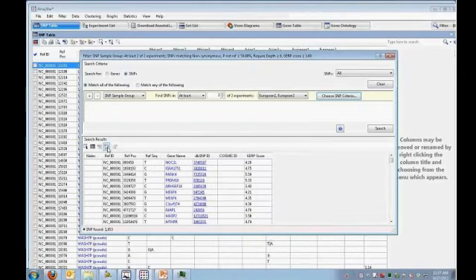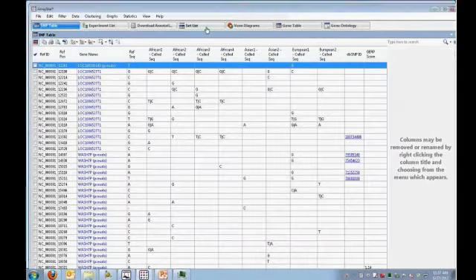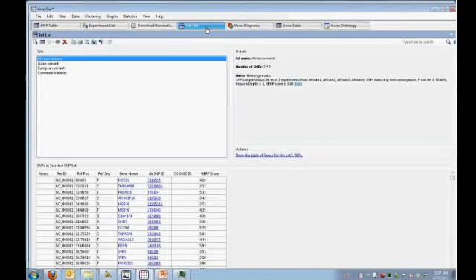And I can save that set by clicking a button here to actually make that set. And then I get a set list. And so here's a set list of the African, Asian, and European variants. And you can see there's some notes in the details section where it tells me what kind of filters I used and how many SNPs. So I can create these sets. And once the sets are created, then I can make comparisons between sets.